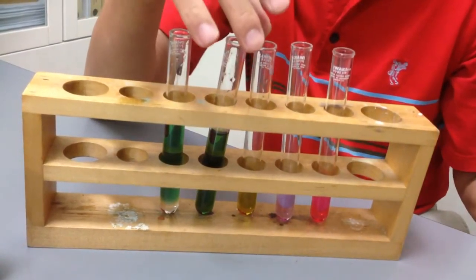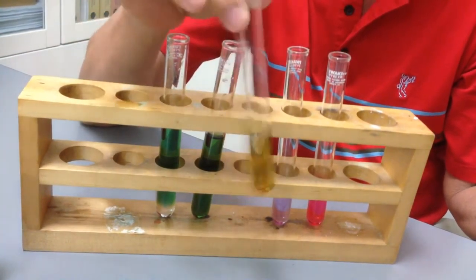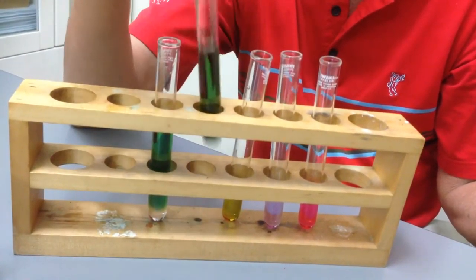So you notice that now, the sodium hydroxide has turned yellow. So it was green at first and then it turned yellow.